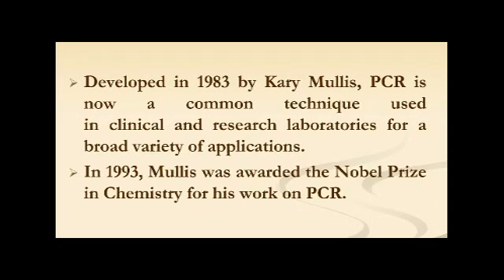PCR was developed by Kary Mullis in 1983, and this is a very common technique used in clinical and research laboratories for a broad variety of applications.